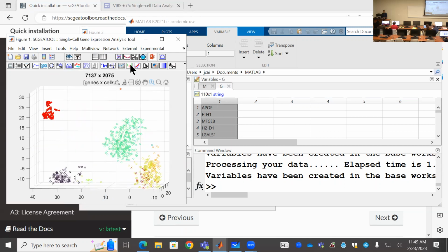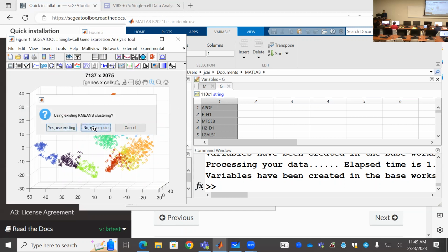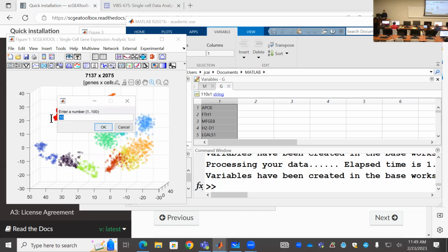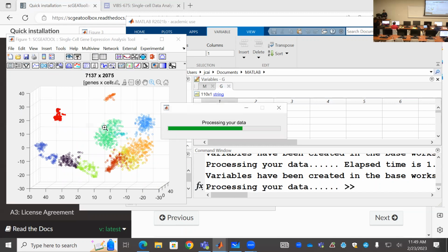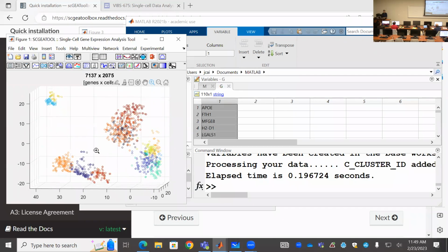So the general procedure I told you before is I do this embedding based clustering, and also I over cluster and recompute. Instead of 11, I probably do 25 and annotate the small groups individually, then merge cell type names.